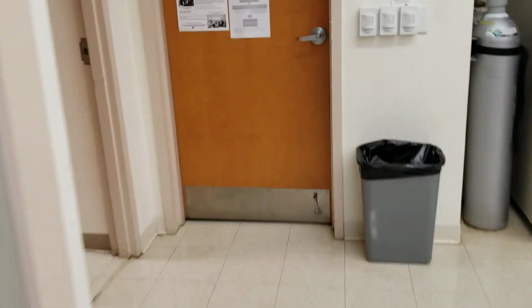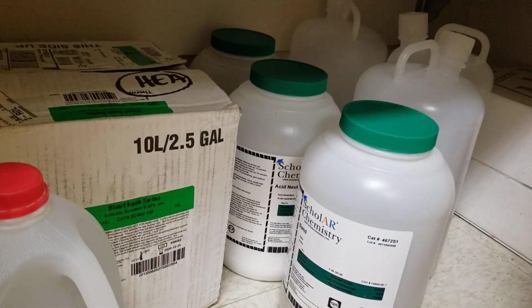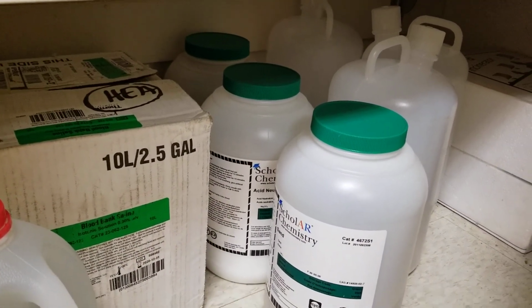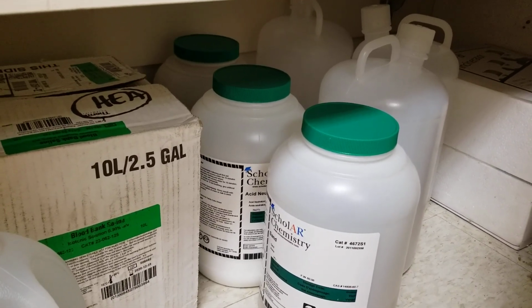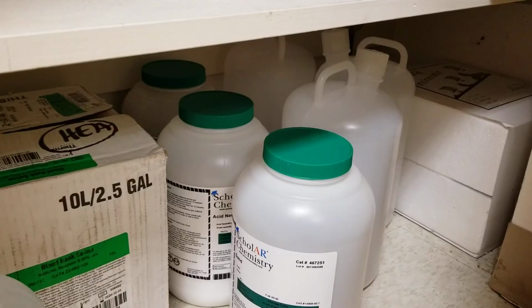This chemical kit is also located in our prep room right next to the cabinet that we have our chemicals in. It is at the bottom here, underneath the last shelf, okay? So same exact contents, except the only place that we have the brush and the dustpan are behind the chalkboards out there.